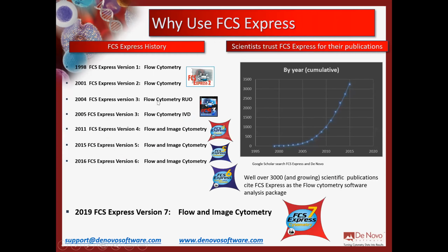So again, if you haven't used us before, we've been around for a long time, since 1998. I was probably still in high school when FCS Express was released for the first time, again, to date myself. So we've been around a long time. People are publishing with us all the time. And right now we're on version 7 of FCS Express.